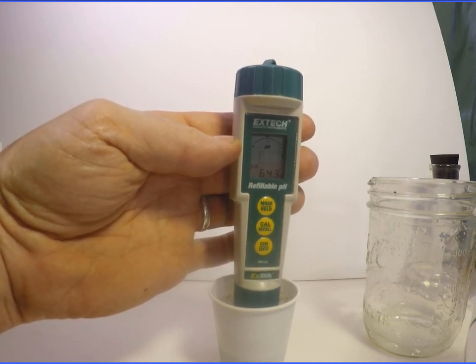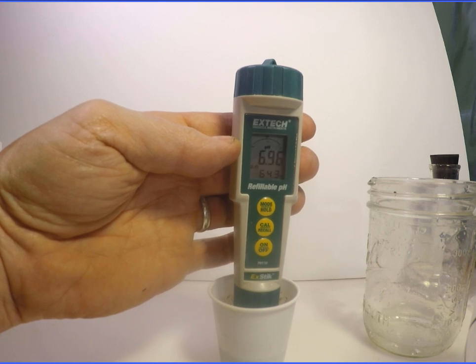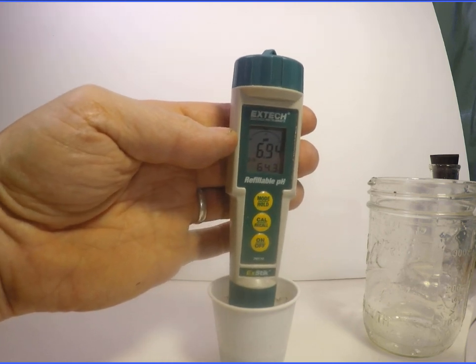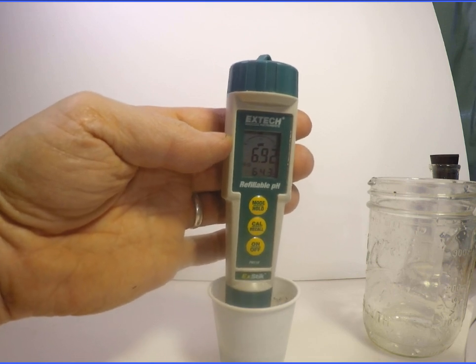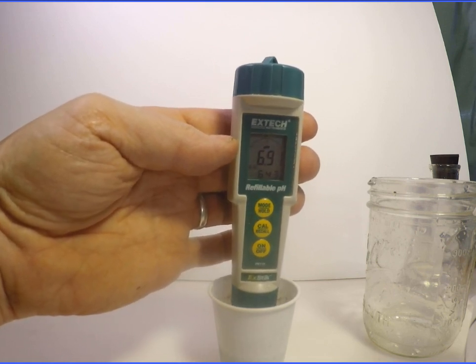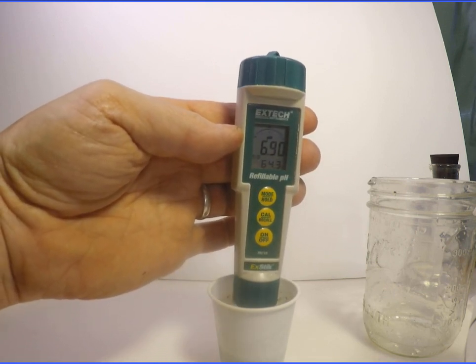You can move the probe gently as you measure, or alternate moving the probe and holding it still to read it. Some pH meters will stop the blinking numbers on the display to indicate when the reading is stable.